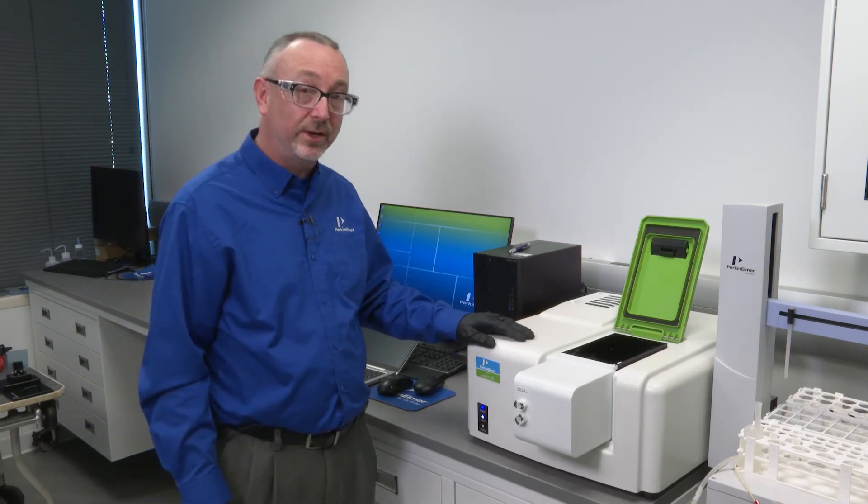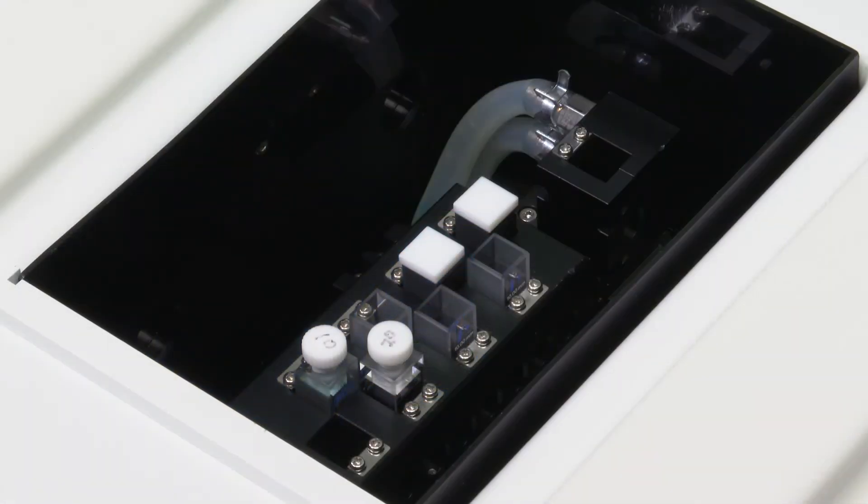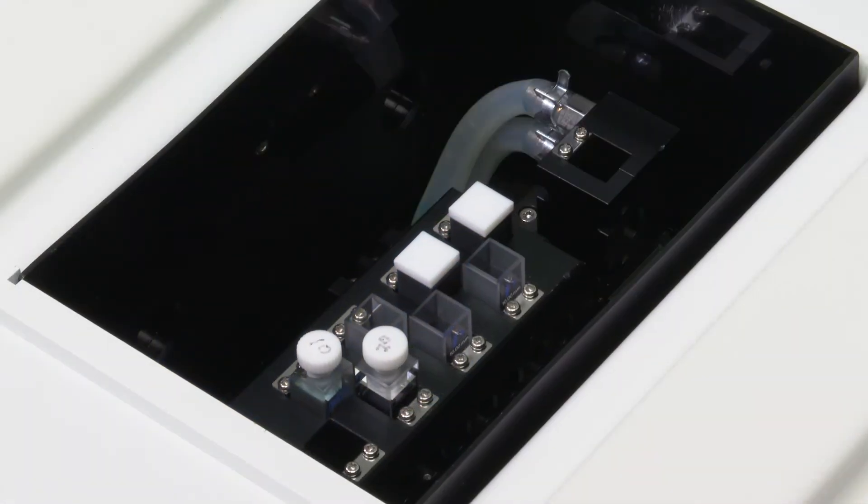Once that's done, I can collect a correction file, typically in position one. Once that's done, I can then press start and let the process take over.